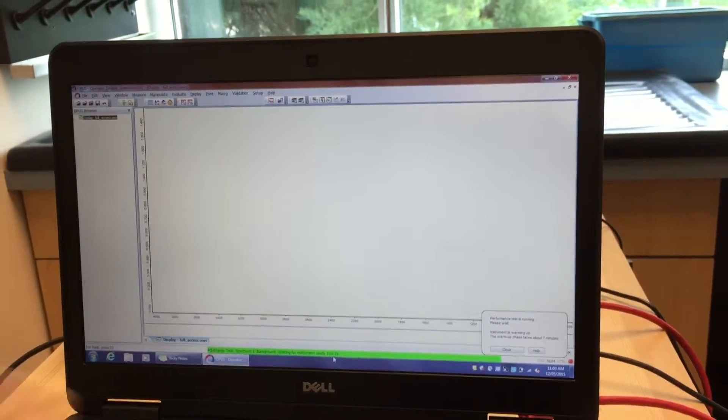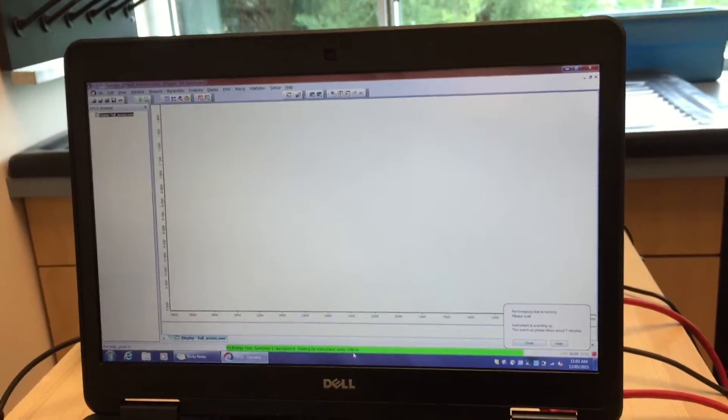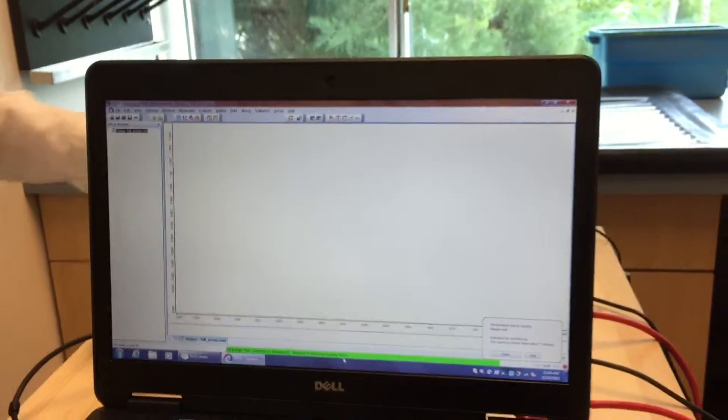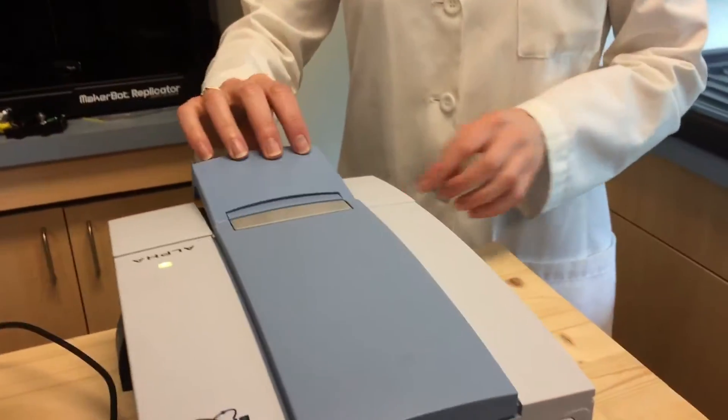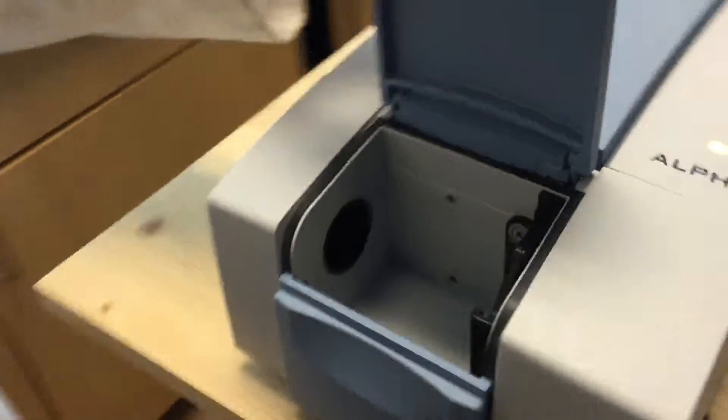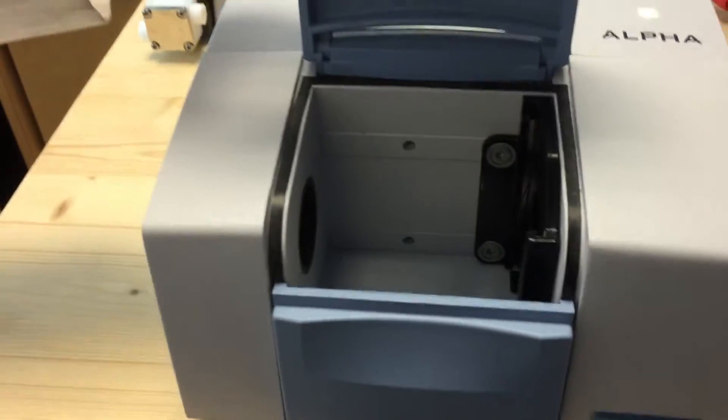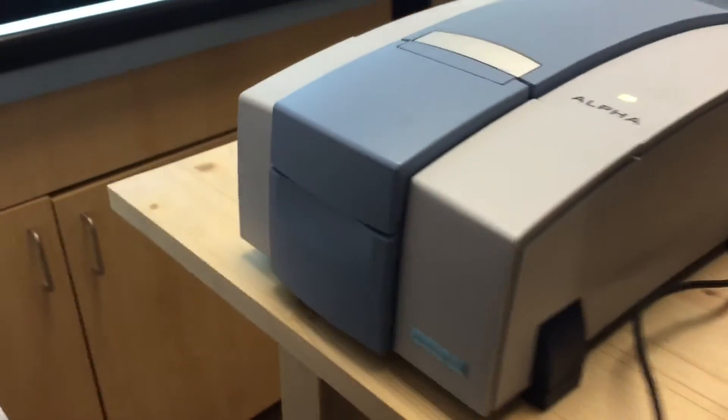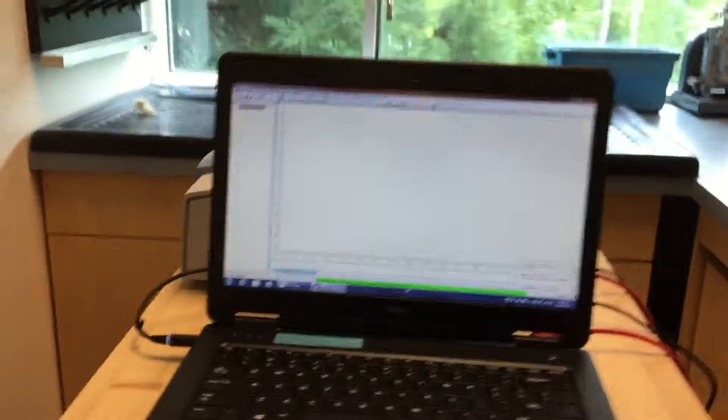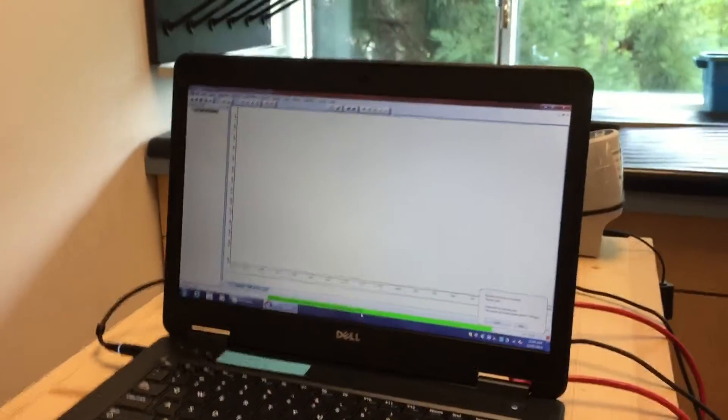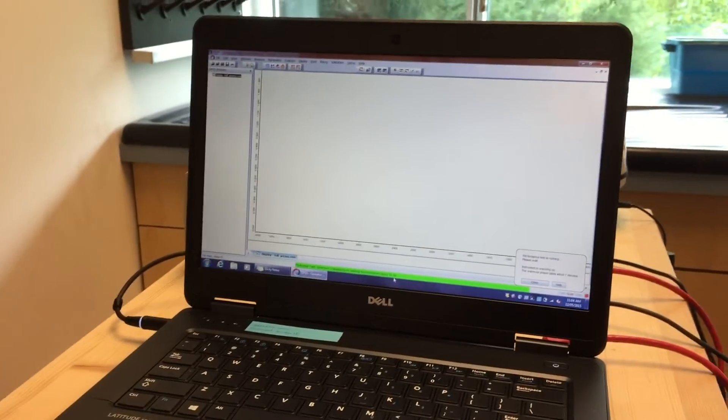Now you just have to let it be and make sure that there is nothing in the way of the IR flow path. There should be no cell or anything in the way here. If you open it up, there will be nothing in there, else the test will for sure fail. Now we just wait. It'll take about seven minutes.